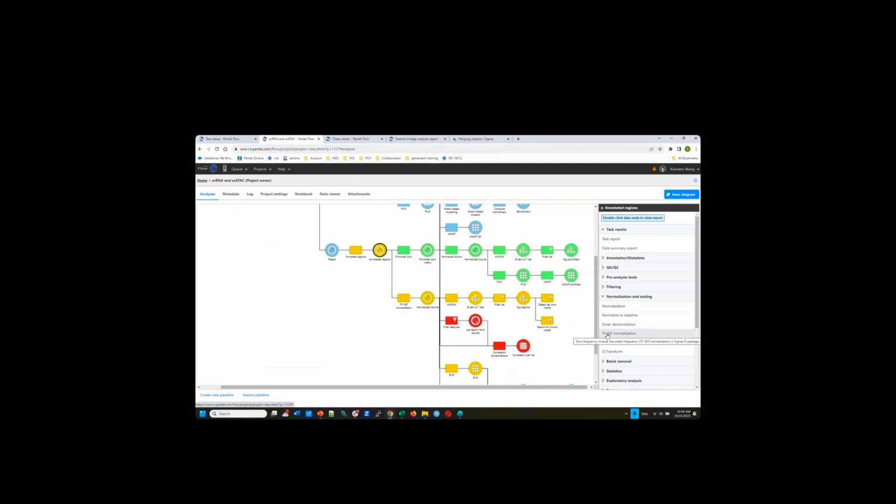The whole idea is they normalize the data both ways: at the cell level, to correct the differences in cell depths, and across all the peaks. They give higher values to rarer peaks. But the bottom line is that after this normalization, the data is in a log space.